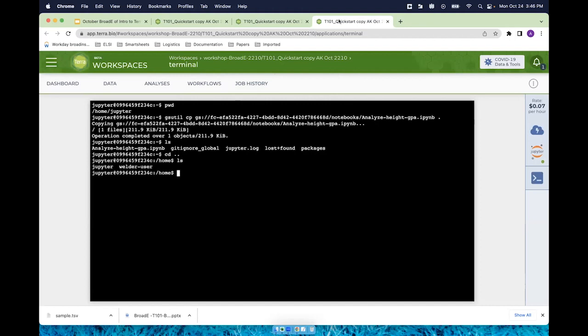I just wanted to make sure that I showed everyone that, because the fact that you can in fact run terminal commands in your interactive environment is very cool. And it also gives you a pretty handy way to find all of the files that you may have generated on your persistent disk. And then you can also copy them back and forth from this location.